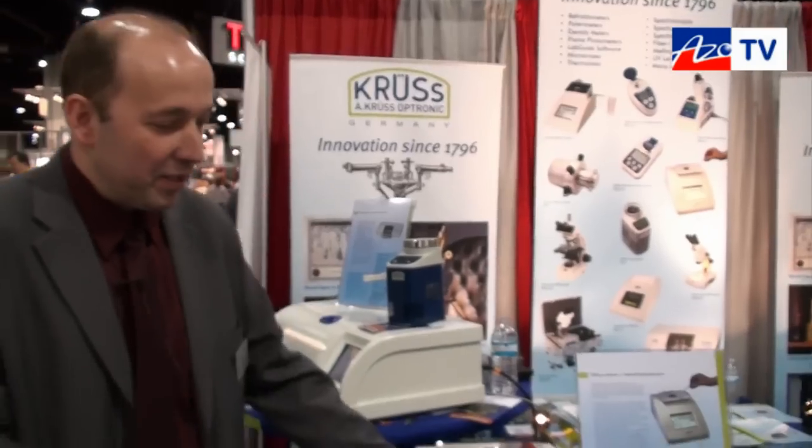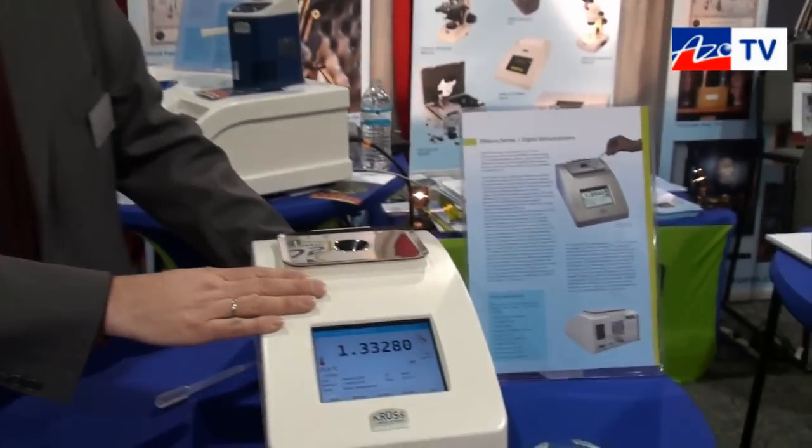This is Cameron Choi bringing you another episode of AZO TV. Today I'm speaking to Stefan Wegner from Kruess, and he's going to tell us about their DR6000 digital refractometer. This is our DR6000 refractometer.